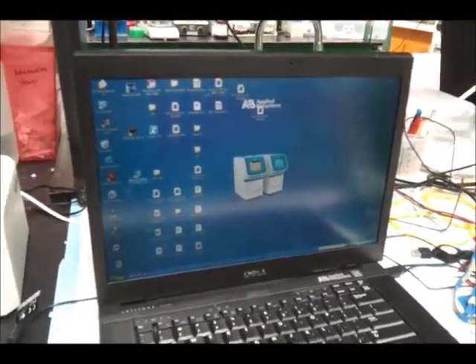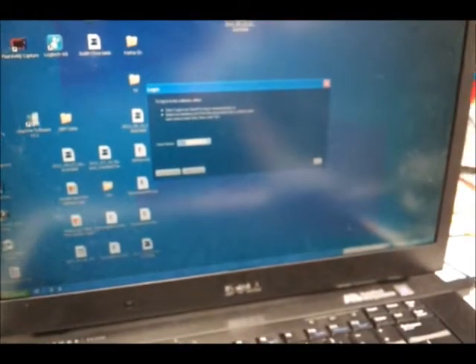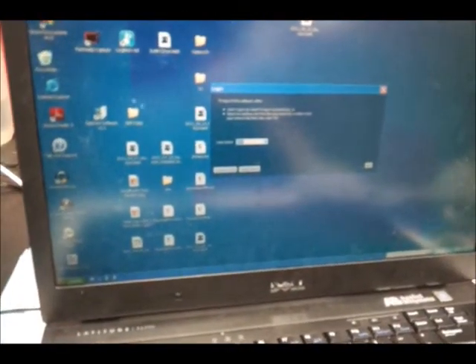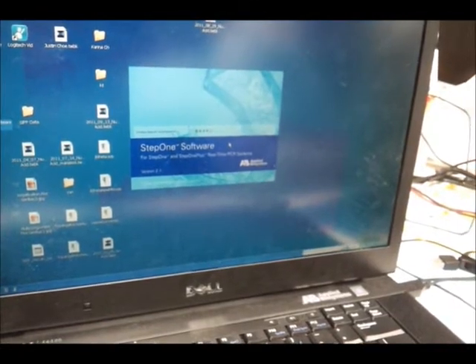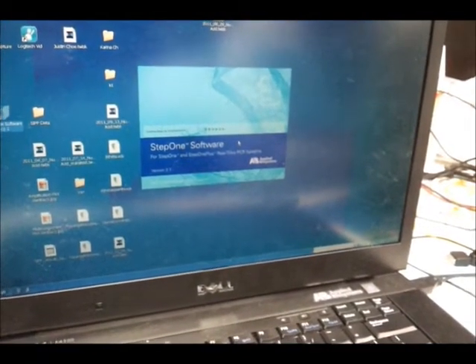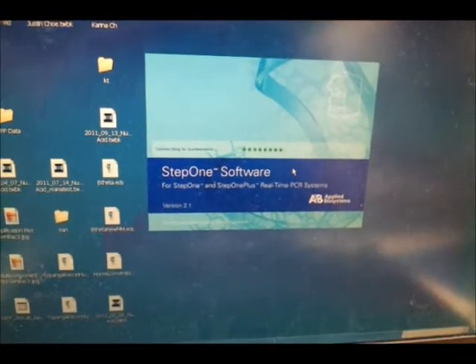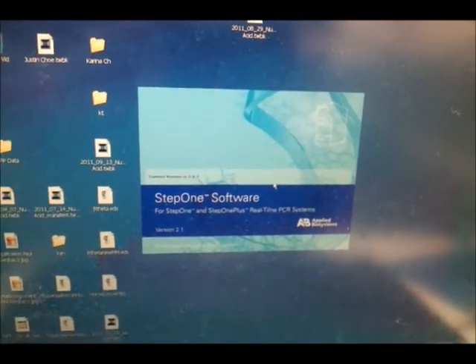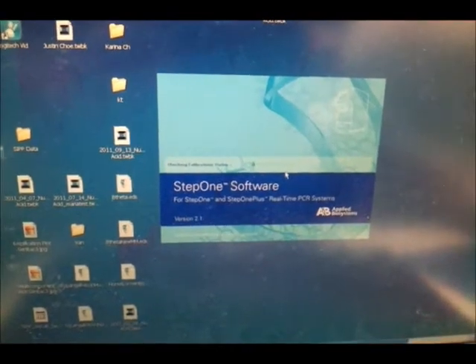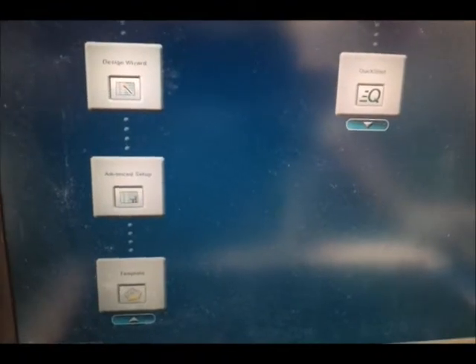Okay, we're rolling. Oh yeah, it's much better. I clicked on the Step 1 Plus icon, which is over here. And then we're signing in as SIP, so press OK. It's thinking for a minute. It's really thinking. The machine whirred up, by the way. So I'm having a hard time seeing, but it's much better on this.